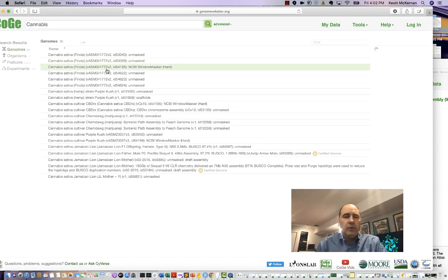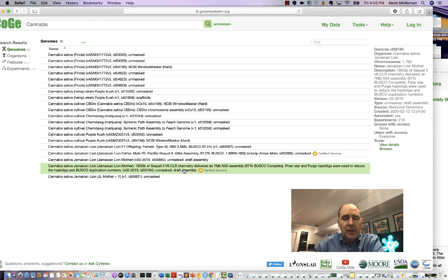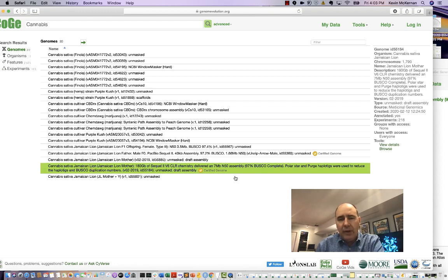You want to click on the one in here that's certified. So right down here, there's a Jamaican Lion mother that's been certified, and there is a male that's been certified. The certification just means that the CoGe team has combed over the annotations and the genome structure, and they believe it meets a certain standard, and they certify it. So these are the best BUSCO score and N50 genomes out there.